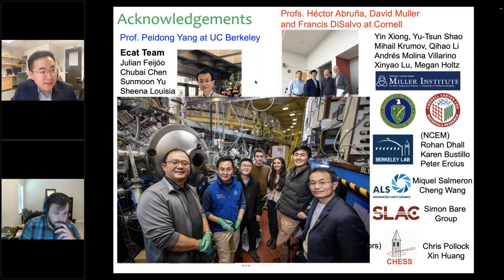So it's fair to say that the hydrogen bubble is not the magic bullet. We would have limitations for reactions that do not have a bubble. What should we do, right? What I can see is that for the CO2 reduction, there's always anywhere between 20 to 50% of faradaic efficiency going to forming hydrogen. So hydrogen is always there. So this is a sort of proof of concept, and it is absolutely critical to minimize liquid thickness.